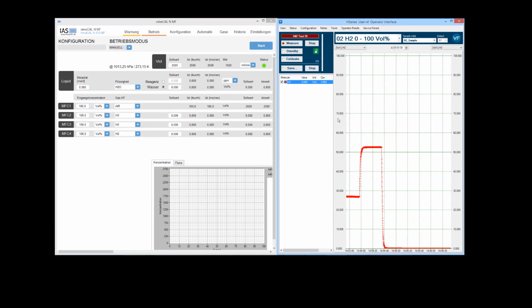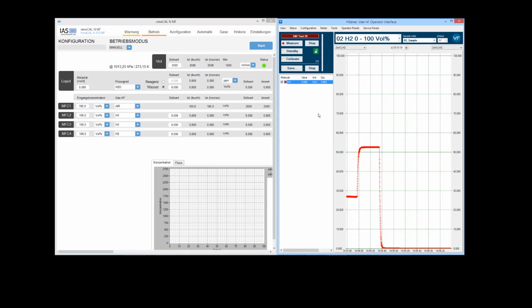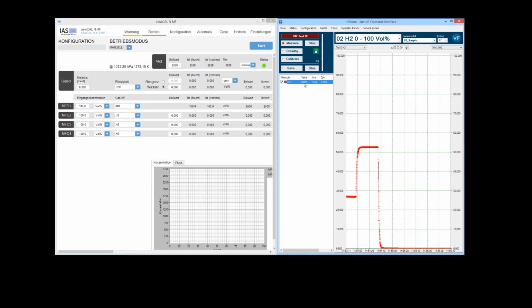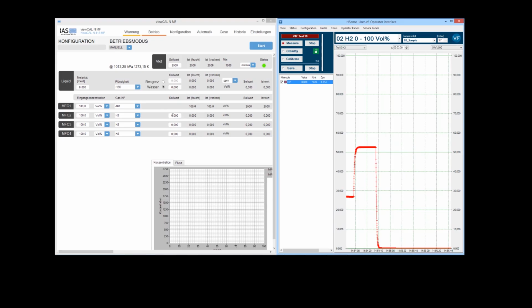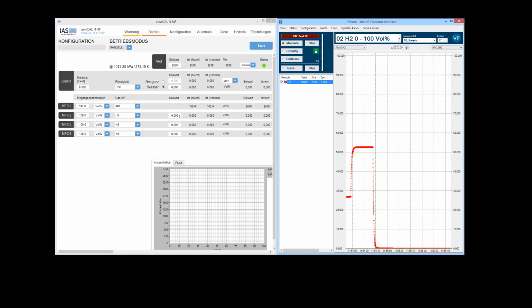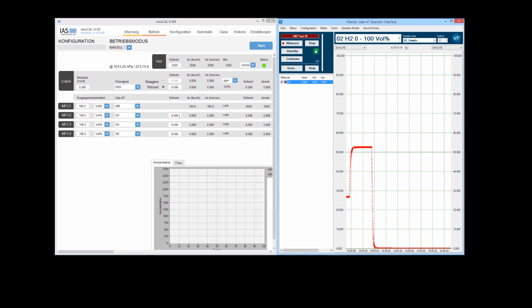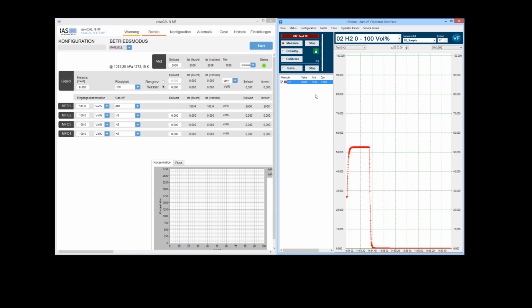So now the process that we are going to follow is we're going to start with an ordinary 2-point calibration. The next step will be we're going to divide our gas from our gas divider in the stated points, and we're going to perform enhancement calibrations for each and every concentration that we apply.